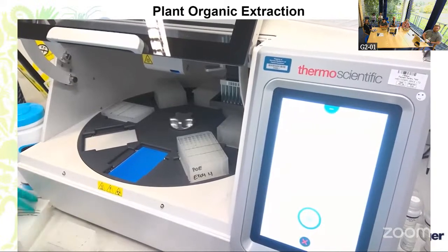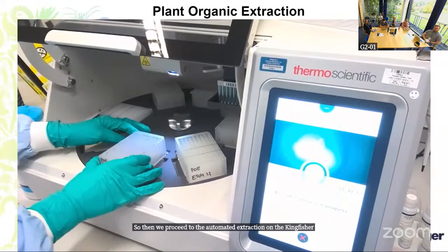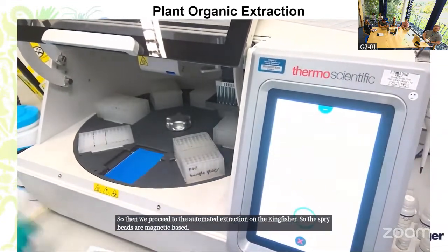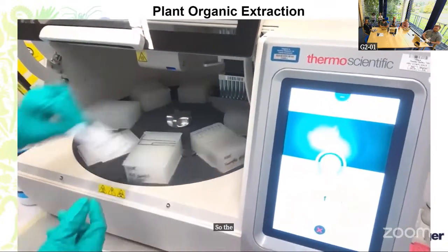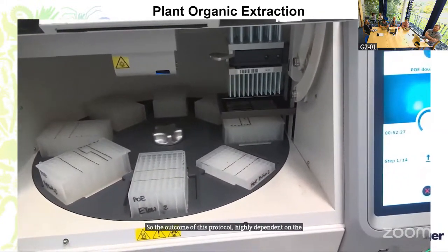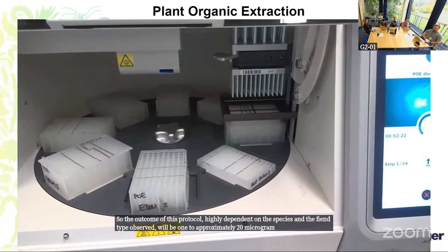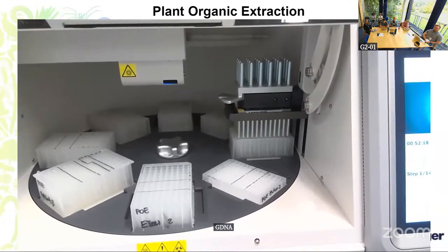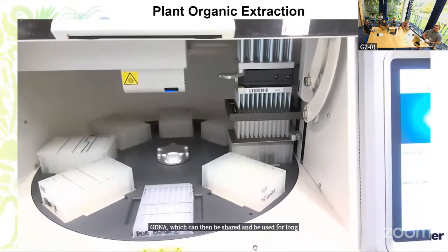Yep, so then we proceed to the automated extraction on the KingFisher. The SpeedBeads are magnetic based, so that is how this operates. The outcome of this protocol, highly dependent on the species and the phenotype observed, will be 1 to approximately 20 micrograms of the high quality, ultra high molecular weight gDNA, which can then be shared and be used for long read sequencing, PacBio long read sequencing.